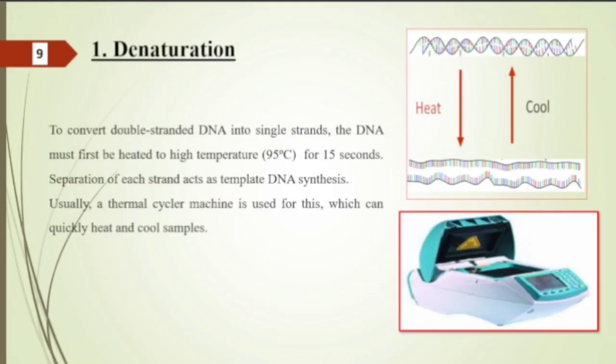Here you can observe the double-stranded DNA. After heating up to 95 degrees centigrade for 15 seconds, this double-stranded DNA is converted into two single-stranded DNA.